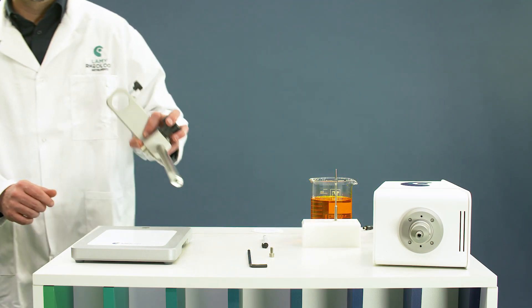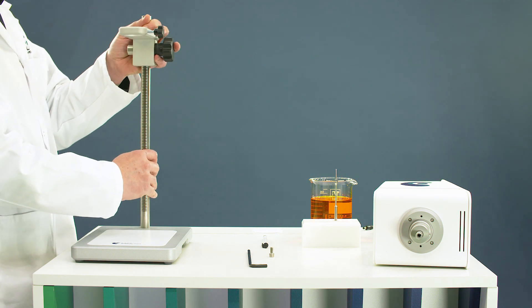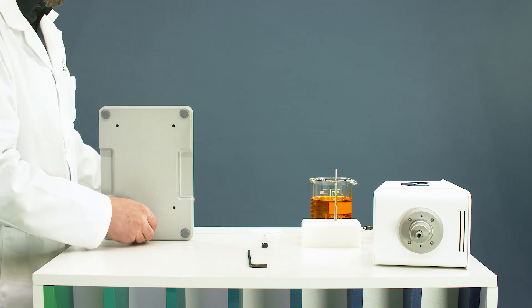Mount the stand to install the viscometer. Present the rod with the arm on the lower plate, then fix the rod with the provided screw.